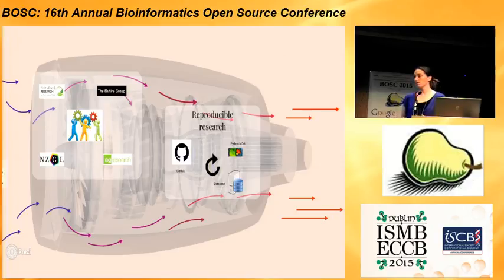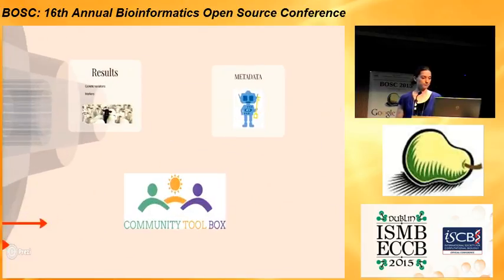Also, most of the scientists we work with publish their data maybe a year after they've actually produced it, and again, we definitely need something we can go back to and help them say what they've been doing.